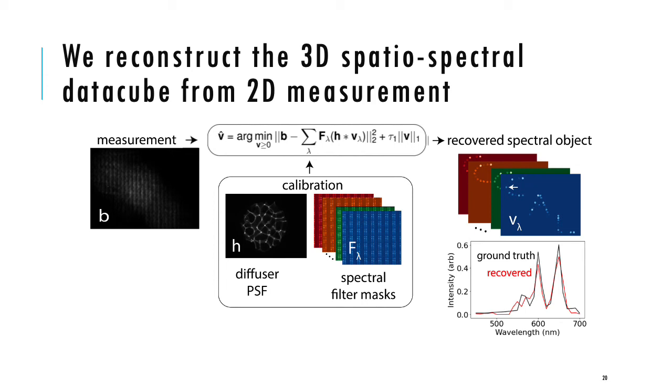Here we simulated the measurement from some beads spelling out "cal" and tried to reconstruct the data cube. As you can see, our recovered spectra matches the ground truth.